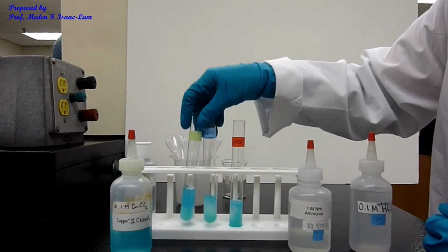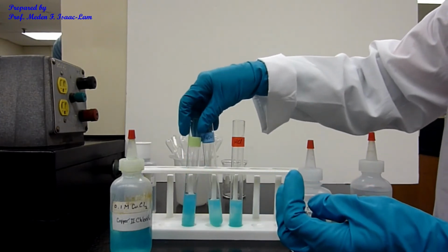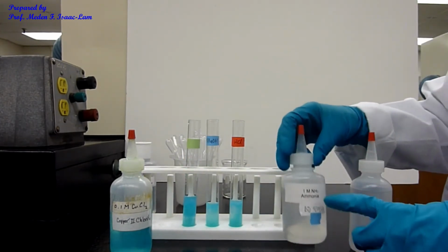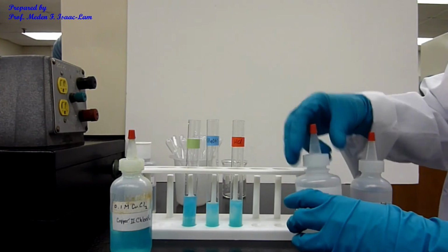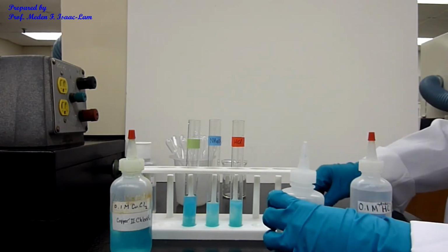So you can see that compared to this one, you have more precipitation. And now I'm gonna add ammonia or ammonium hydroxide in this tube. So approximately the same quantity as the first one.